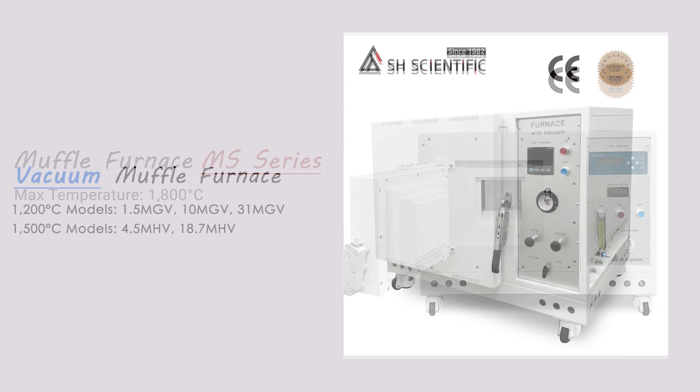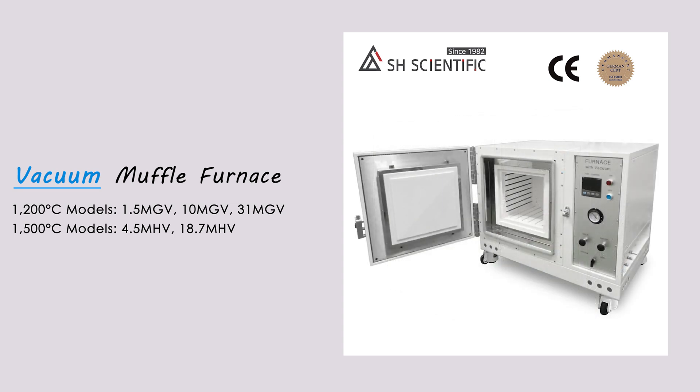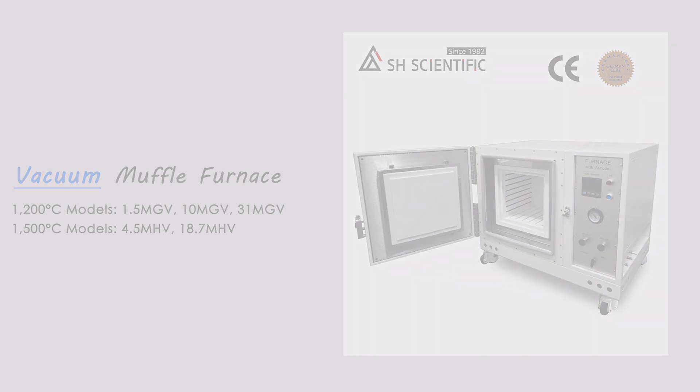And we have vacuum muffle furnaces for vacuum brazing and sintering under gas atmosphere. So if you're looking for a higher temperature range as well as a vacuum furnace, just let us know what you need.